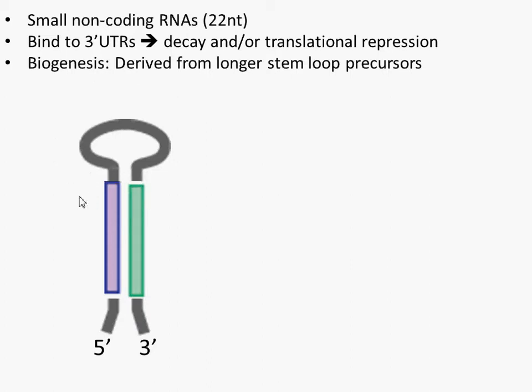Ever since deep sequencing has been on the scene, we're aware that there has been a lot of variation that can occur at the ends of these processed microRNAs, these mature species, and they're the features that the miRspring document reports on. So the miRspring document can give you counts and statistics on the 5' isomiRs.